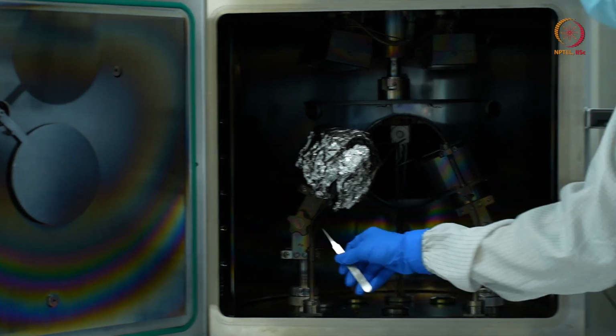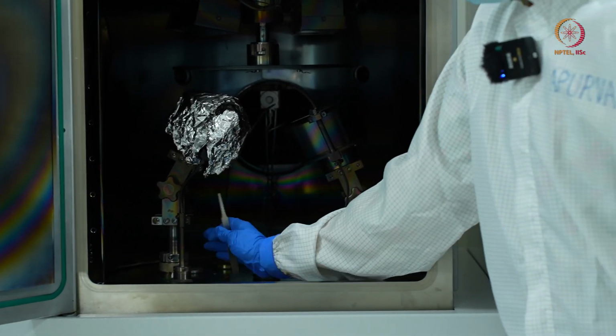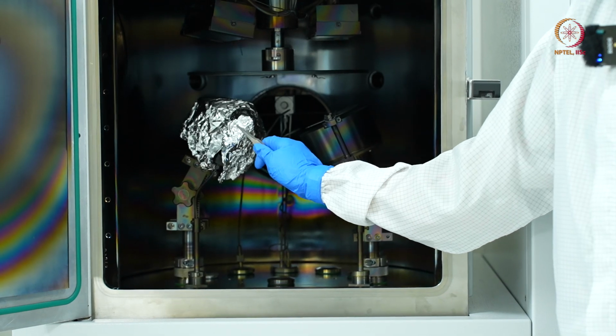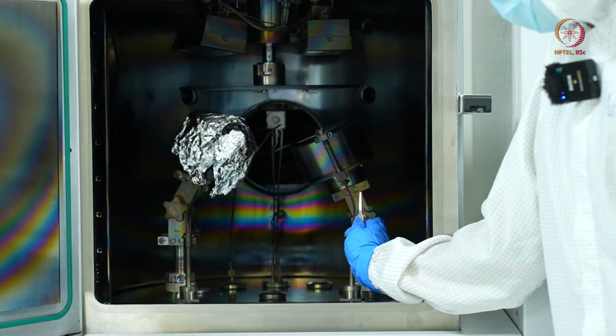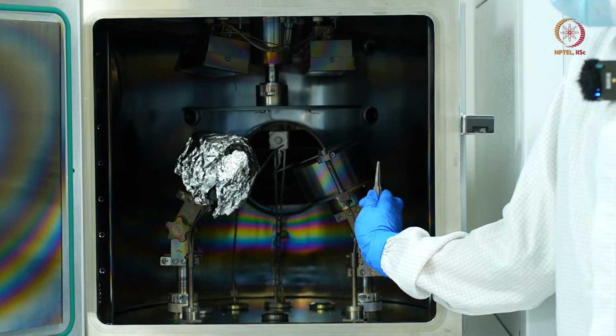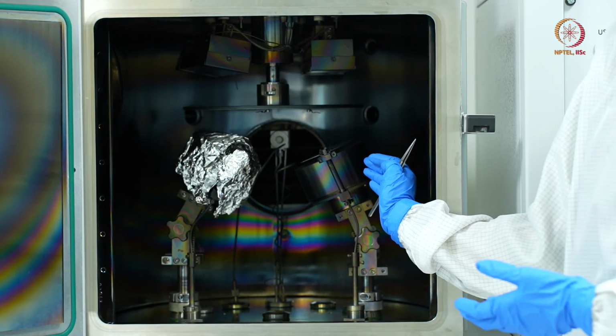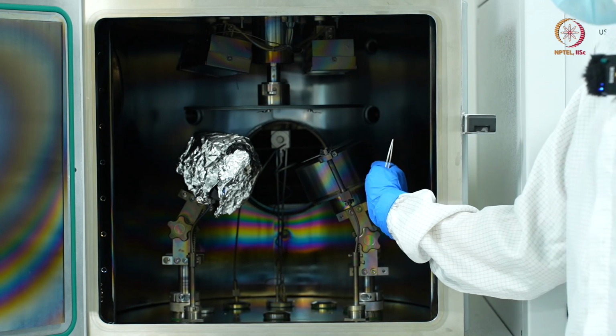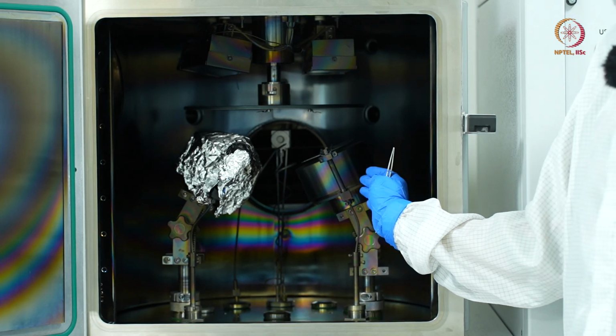So here there are two magnetrons. The left side magnetron is dedicated to RF sputtering, and the right side magnetron is dedicated to DC sputtering. In today's deposition, we'll be depositing tungsten using DC sputtering.